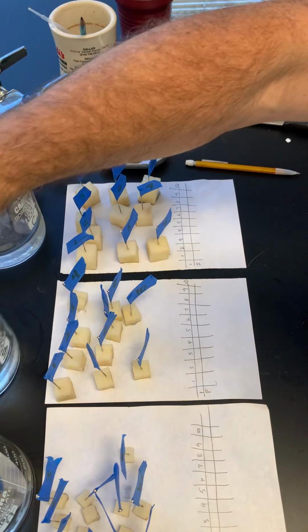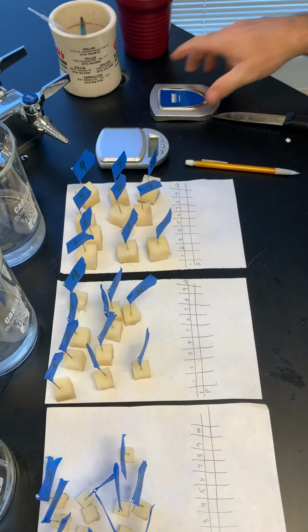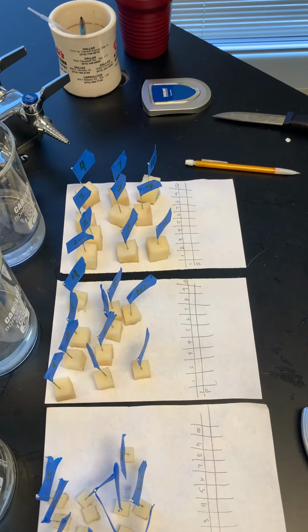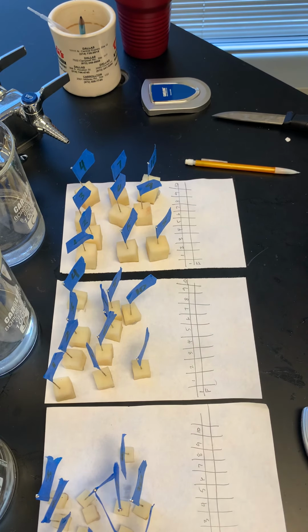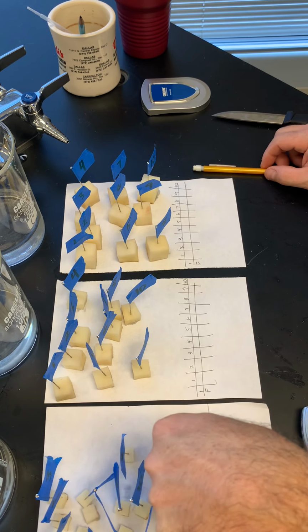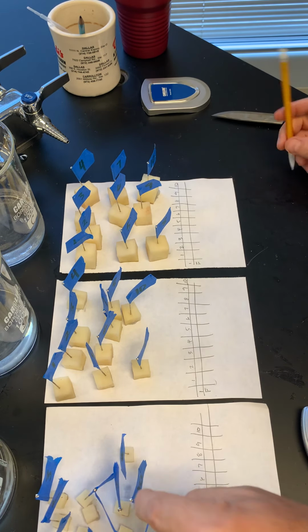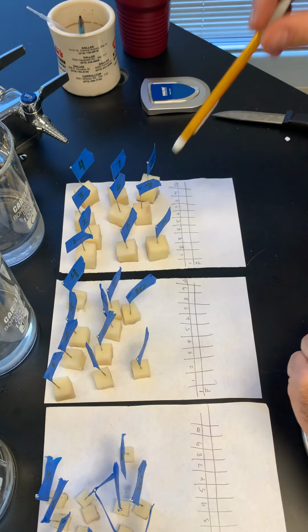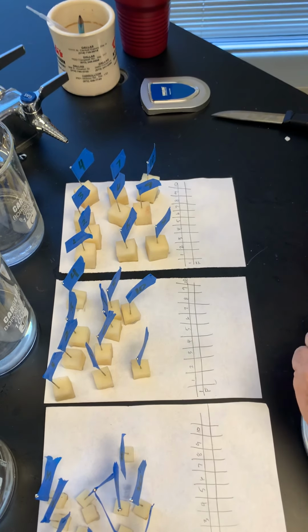Okay, we're gonna do the potato osmosis lab. And you guys, when you watch this, know that there are 3 different variables that you could choose. I'm gonna choose what I think is the most interesting, the surface area to volume ratio, as my variable. So this set of potatoes, these small ones, are 1 cubic centimeter. These are 1.5 cubic centimeters, and these are 2 cubic centimeters.